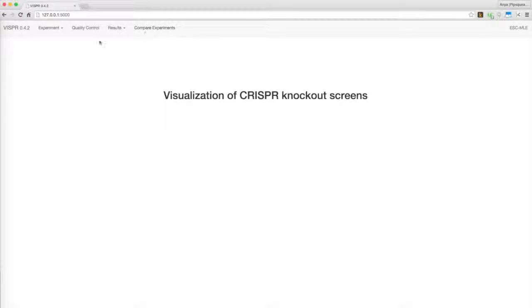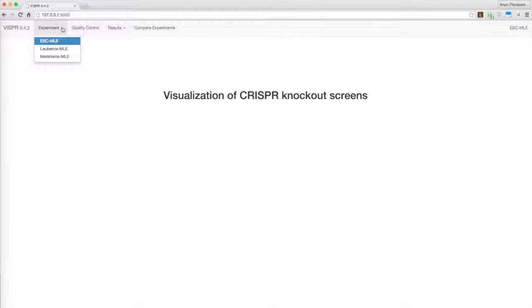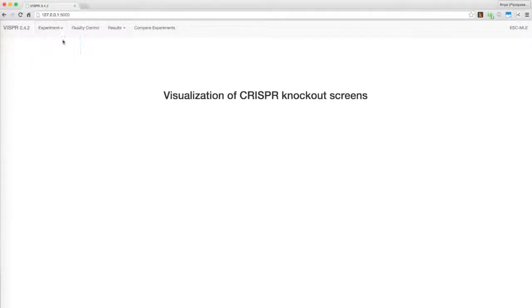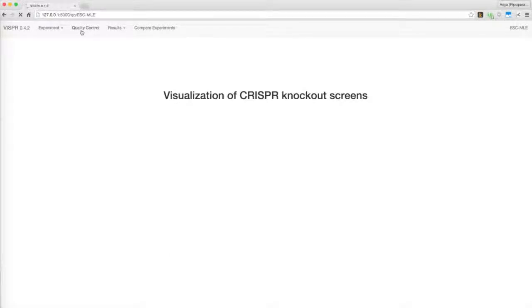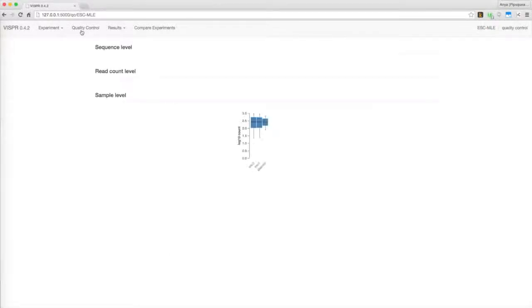Vispr can be invoked with multiple experiments at once, allowing you to draw comparisons. The demo includes data from three experiments. We'll choose the one corresponding to an experiment with embryonic stem cells. The next three tabs allow you to choose how to view the data. In this video, we're going to explore the Quality Control tab.